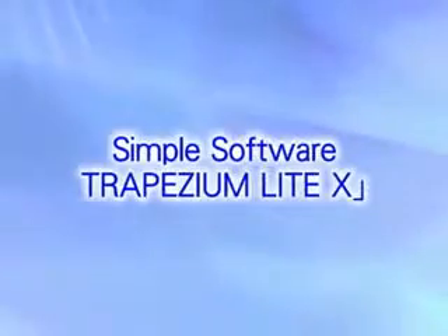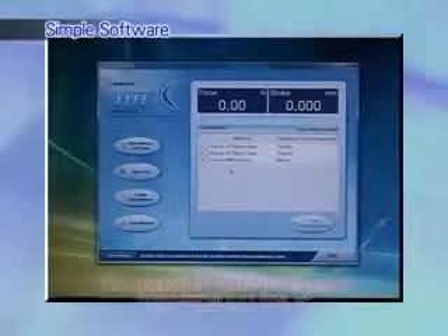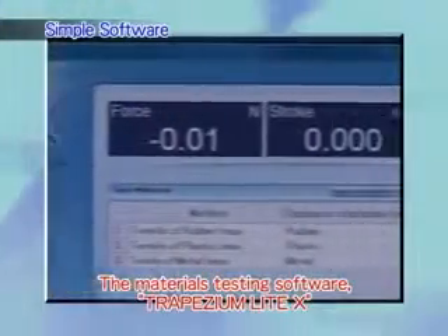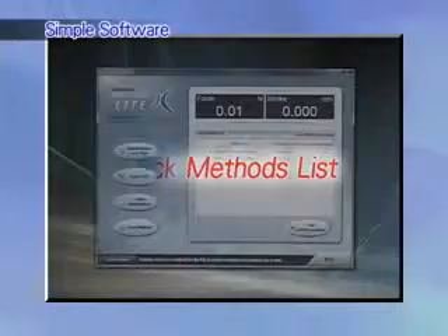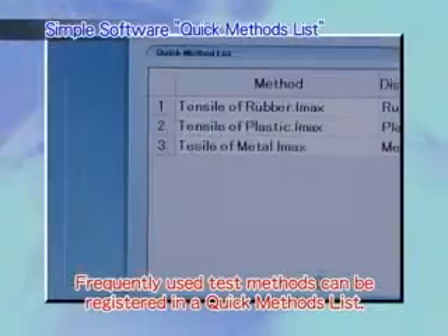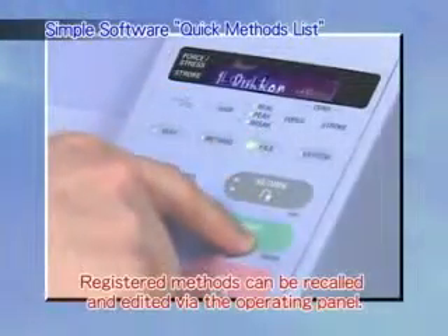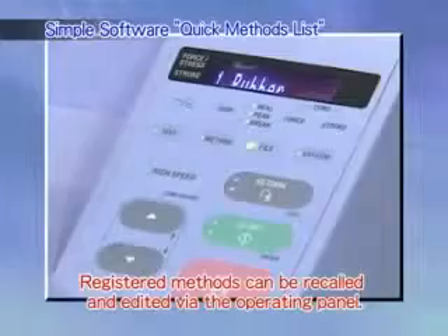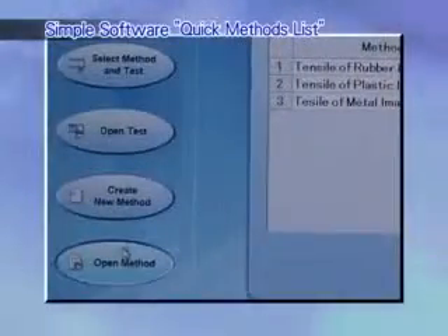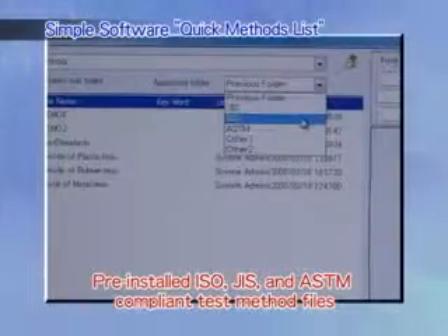Simple software. The materials testing software, Trapezium Lite X, offers a variety of features that make it easy for anyone to fully utilize the AGSX system. Frequently used test methods can be registered in a quick methods list to allow tests to start more quickly. Registered methods can be recalled and edited via the operating panel. Pre-installed test method files are provided, compliant with ASTM, ISO, and JIS, or the Japan Industrial Standard. This makes it easy to perform standards-based testing.